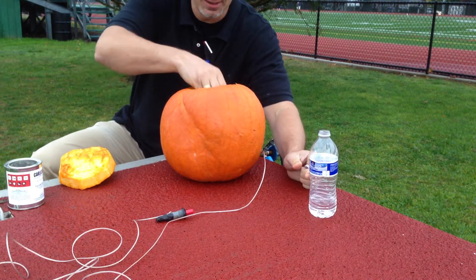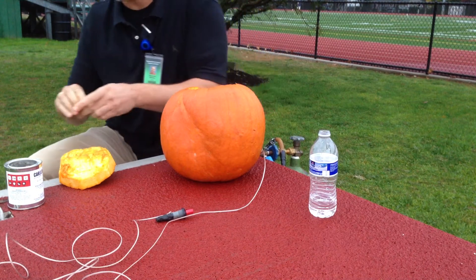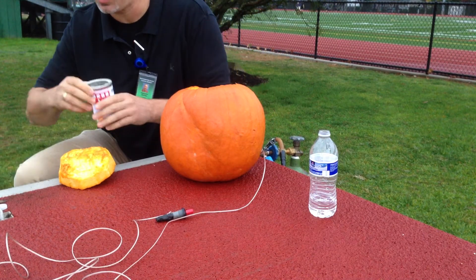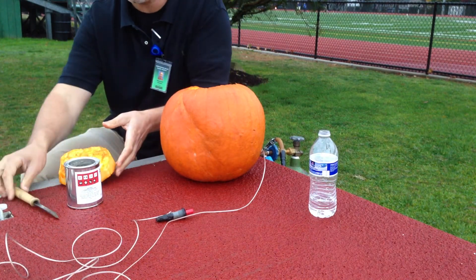I've got some water and we're going to drop some calcium carbide — it's an acid-base reaction that's going to make acetylene gas. Before I do that I want to charge this up since I'm really after a combustion reaction.